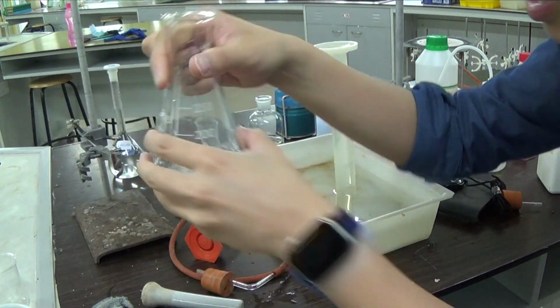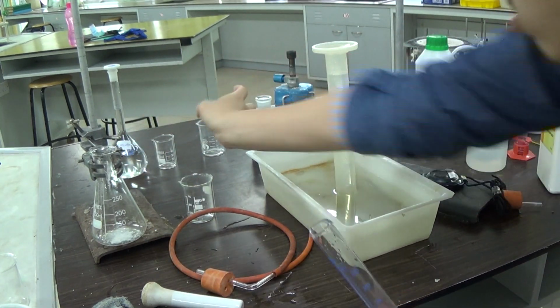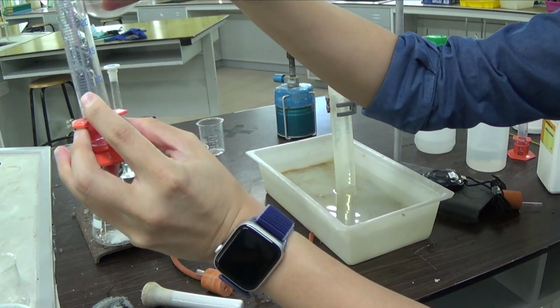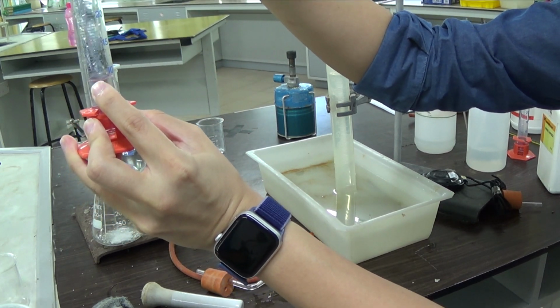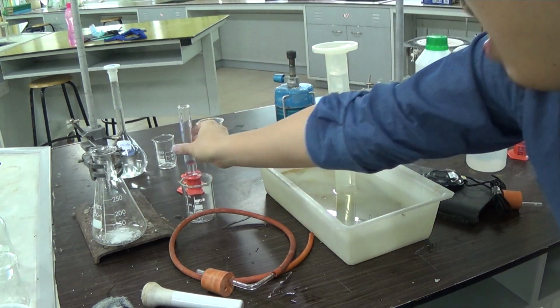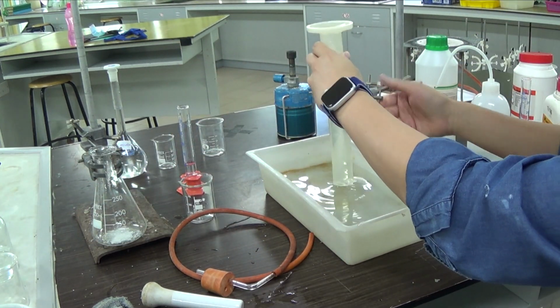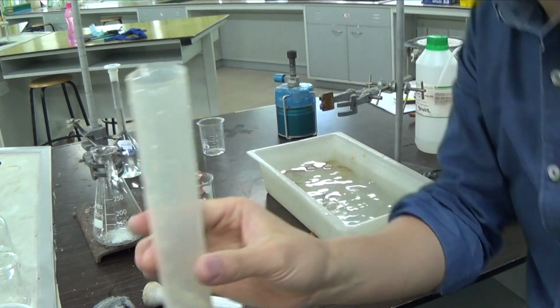So the powder stuff are inside. Just now, I used hydrochloric acid. I used 10 milliliters, so I'm going to use the exact same volume. So the volume of the acid and the concentration of the acid remain the same. I should probably redo my measuring cylinder displacement. So I'm going to show you how to do it again.